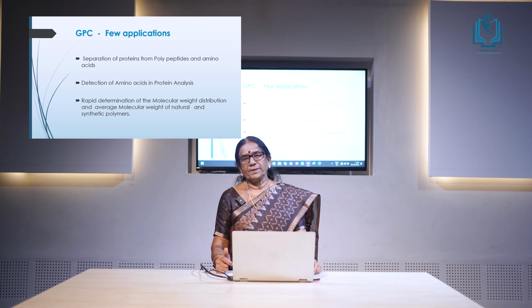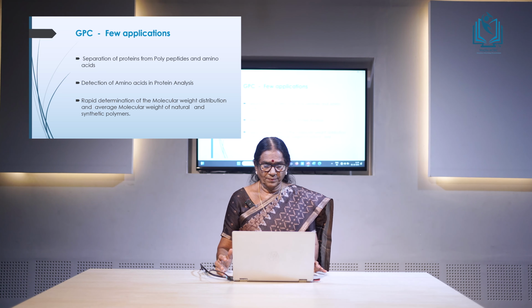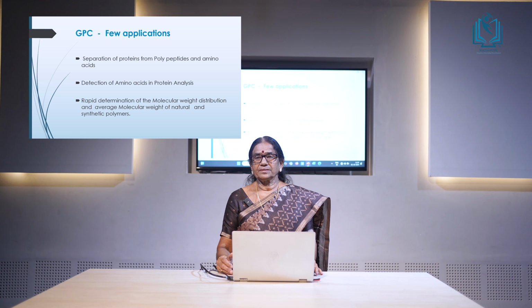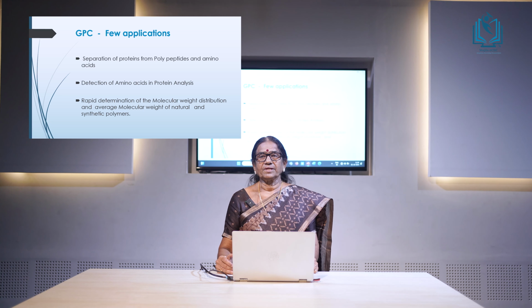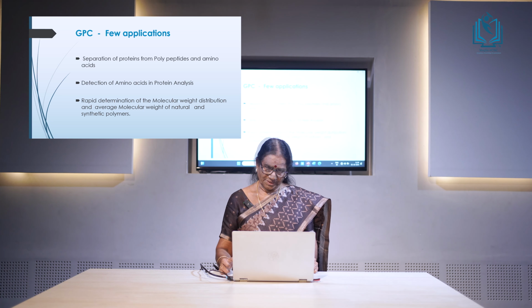The applications are widely applied in many fields. I will cite a few applications: the separation of proteins from polypeptides and amino acids, the detection and estimation of amino acids in protein analysis. Then, as we have seen, the rapid determination of molecular weight distribution and average molecular weight, the number average and the weight average molecular weight of natural and synthetic polymers.